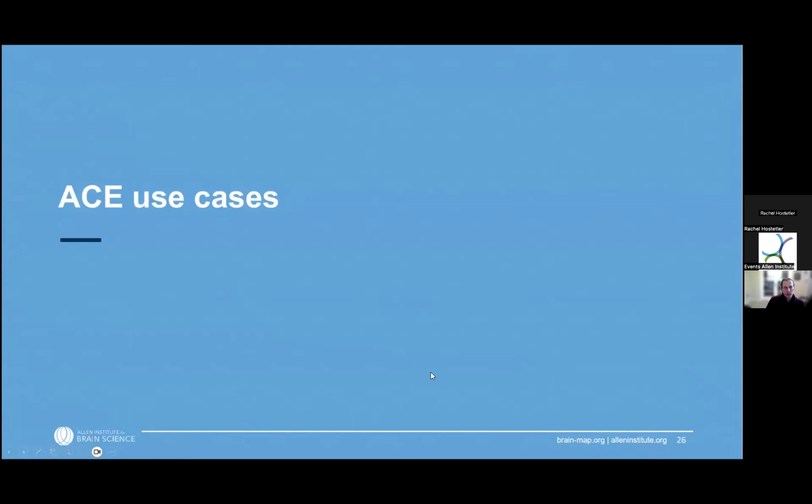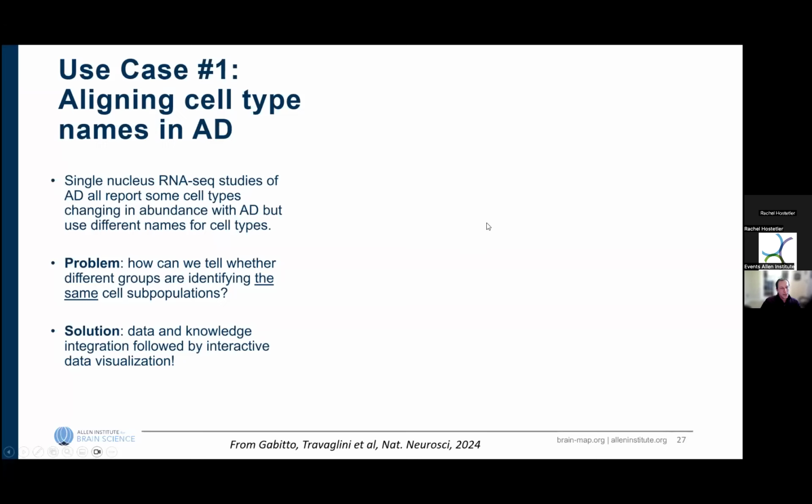Okay, so that's most of the visualizations. There's one more that I'll show in this use case example, but now I want to jump into how you do these use cases. These are going to be pretty similar to the ones that I've talked about before, but I just want to go through again how you would use this tool for them.